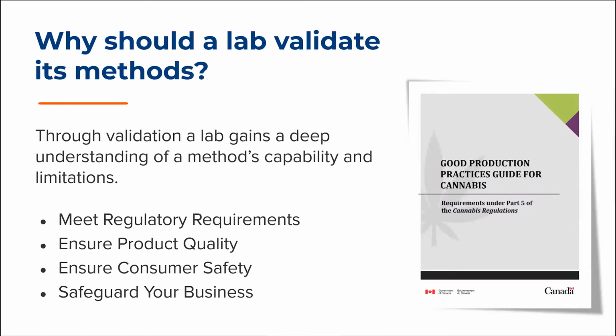But first, we need to ask a few questions about what validation is and why we do it. First, what is method validation? There are several reasons to validate an analytical method.